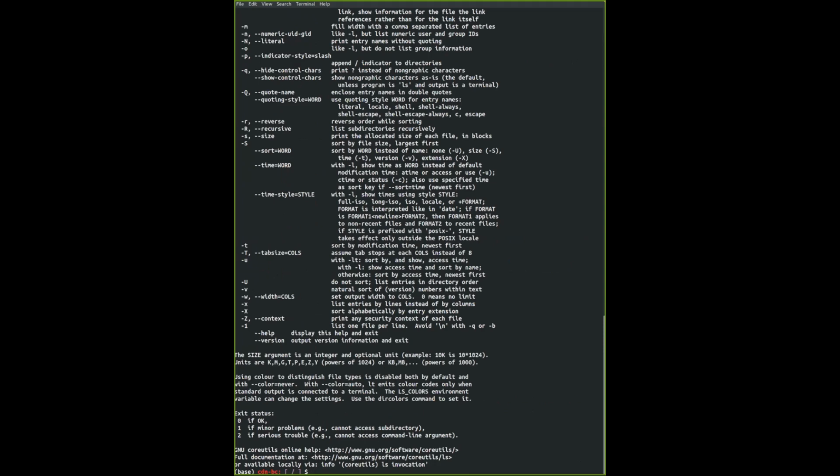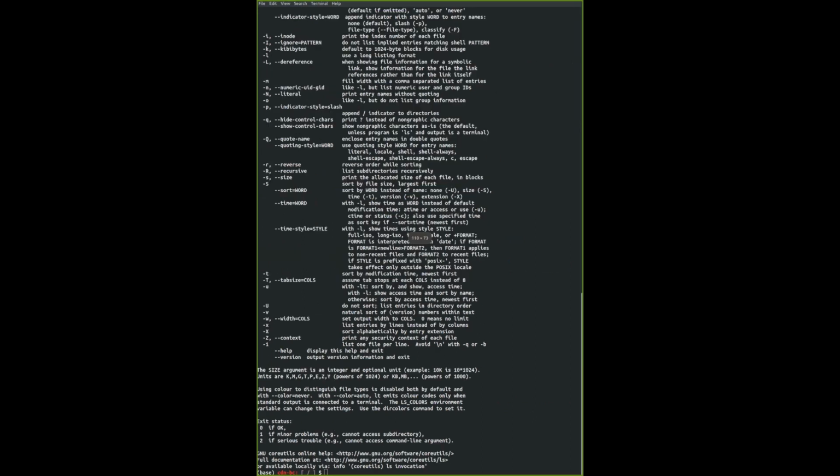Sorry, yes. Can you scroll down? I can't see the bottom. Oh, you can't. Okay, let me see. I'll show you in a bit how to clear the screen. I'm going to show you again. What I did was type ls, the function, and then double hyphen and help. I can't see the typing. You can't? Okay.